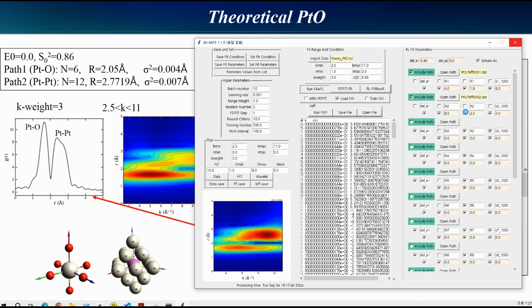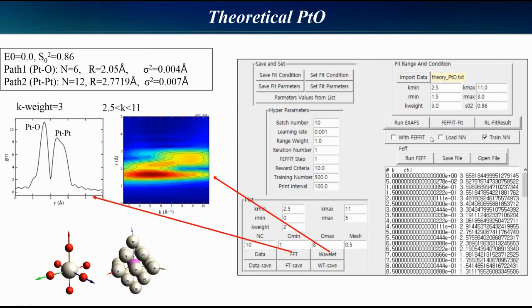So you want to find how efficient the deep RL is. Okay, let me check here.